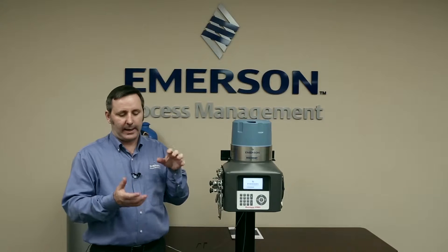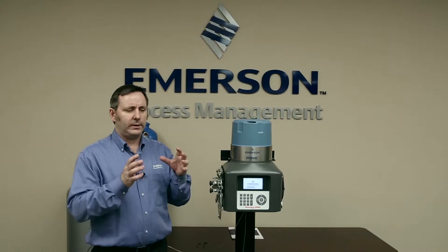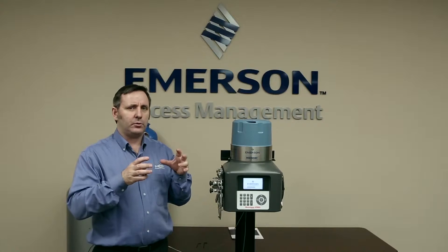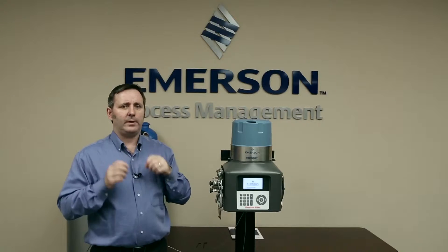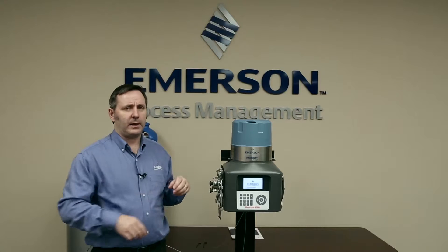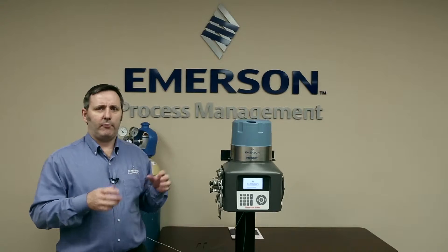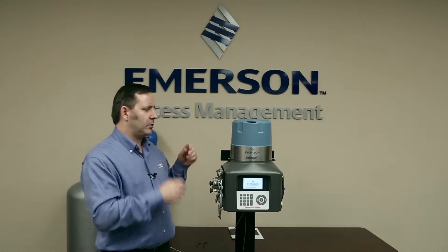What we have is an analytical module that has the columns, the detectors, and the analytical valves all inside this analytical module that can be quickly removed and then replaced with either a new one or an overhaul module and put back in line quite fast. So what I'm going to do is go through the process of removing the module and then putting the module back on.